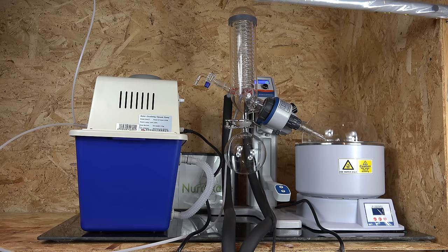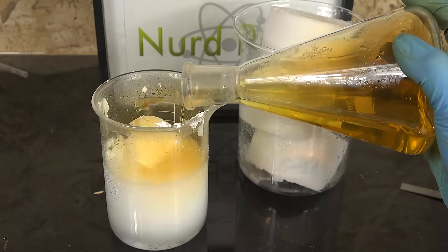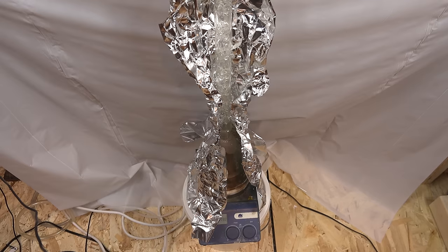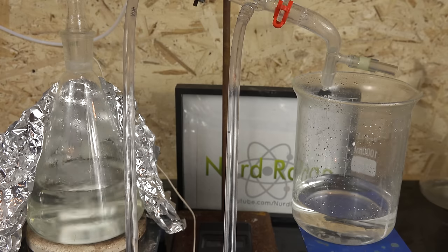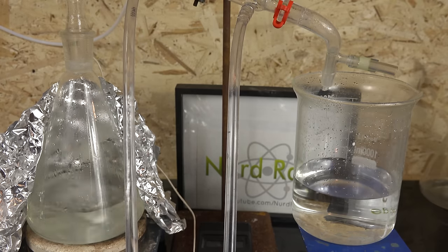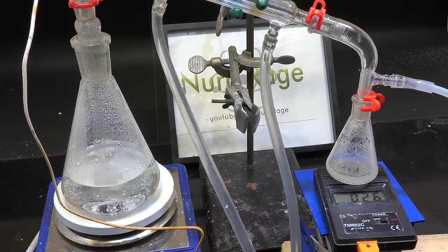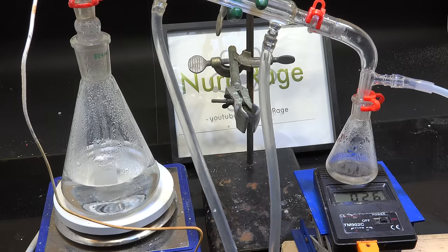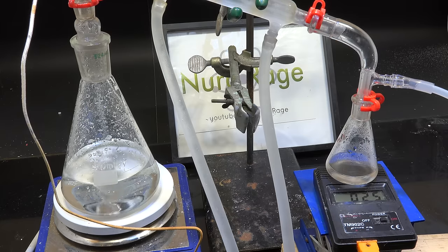What is a rotovap and why would we want one? In chemistry, most of the time we perform reactions in solvents and then recover the products from that solvent. If the product is volatile we do a fractional distillation; if the product is non-volatile then we evaporate off the solvent. Evaporation is pretty slow though, so to improve recovery speed sometimes we'll use heat to drive off the solvent by boiling. For even faster recovery we may apply a vacuum to lower the boiling point of the solvent.